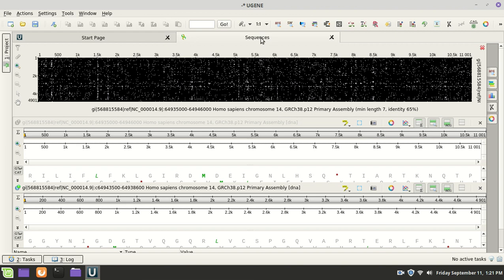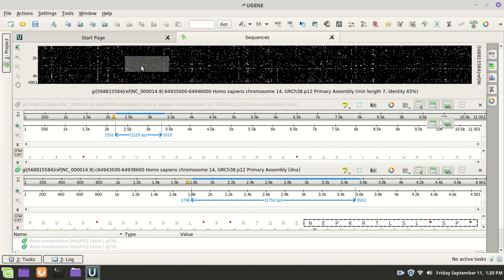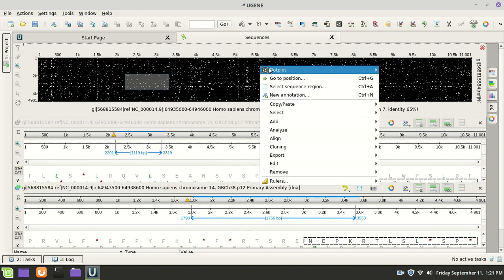But as you can see, when I do this, it does give you where you're looking down here. So I created this little square, and that's showing you where in the sequence you were looking. So that could be useful to you if you're looking for something. But of course, this is not useful. There's too much. It's finding too many dots.